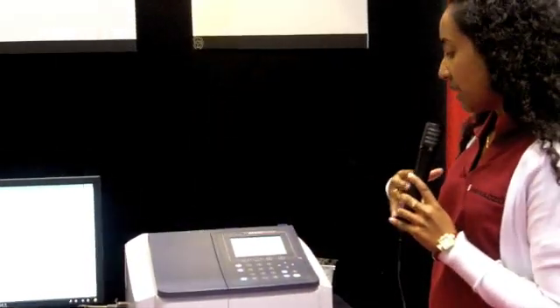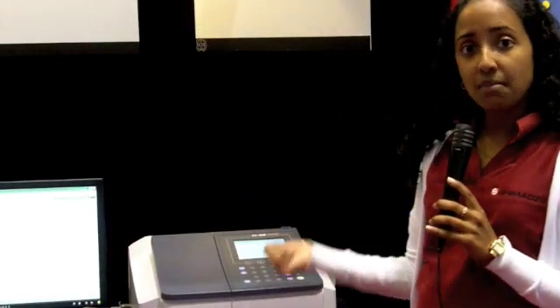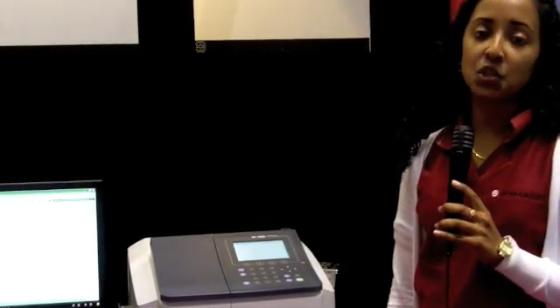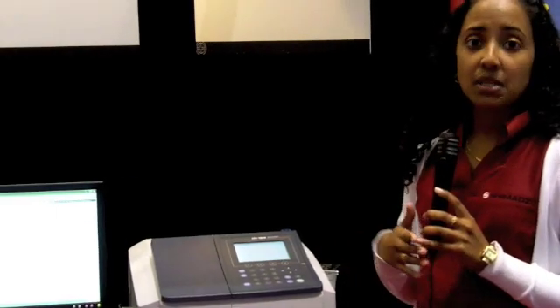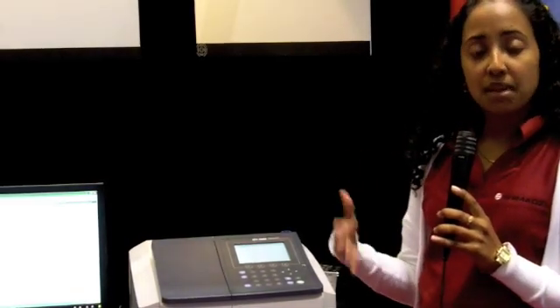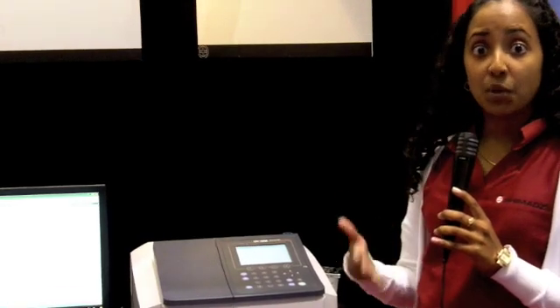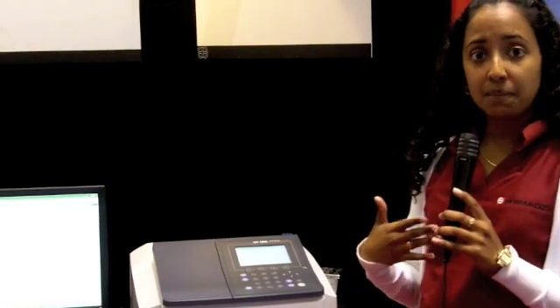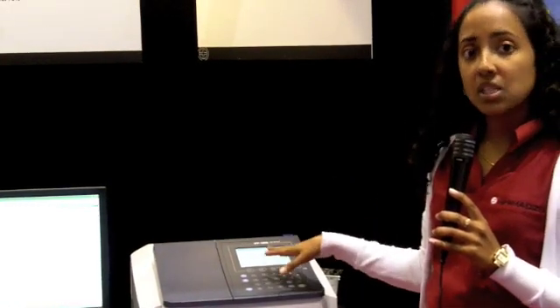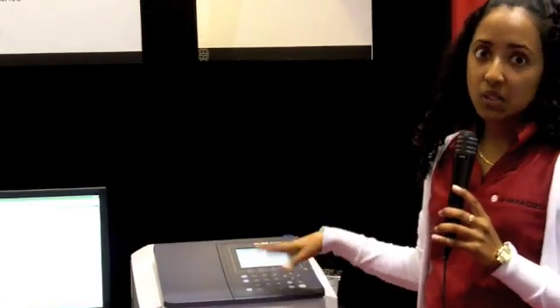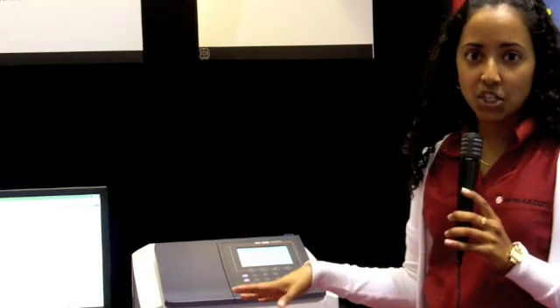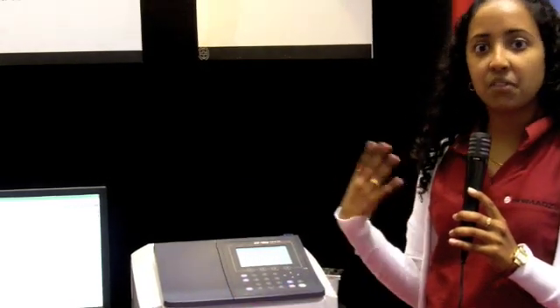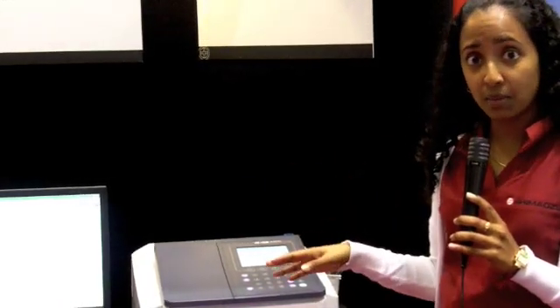Some of the nice things I like about the instrument is there's a built-in bio method for customers that do DNA quantitation and RNA quantitation. There are also built-in methods like the Lowry, the Buret, and the BCA. So those methods are built-in. It's not specifically for that application, but if a customer needs it, it is available.